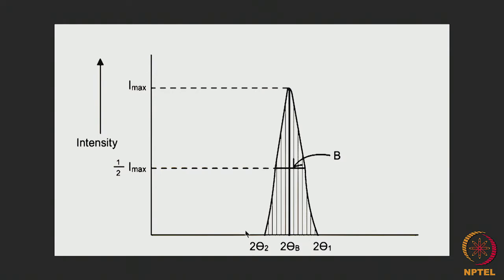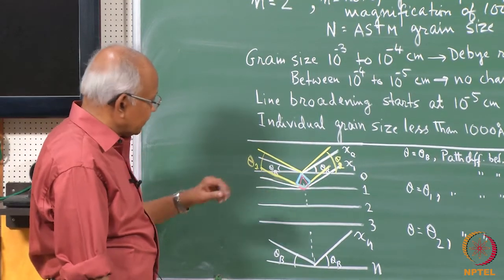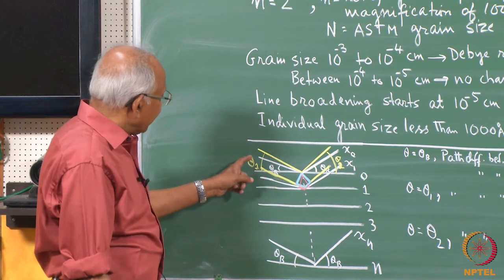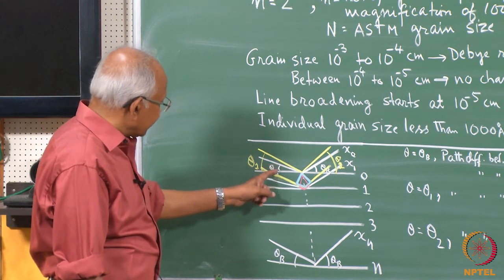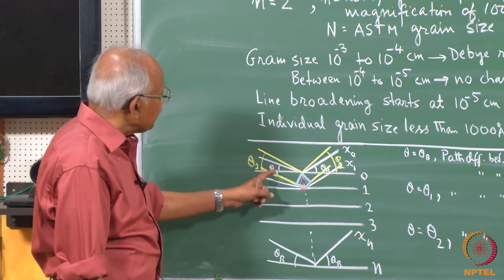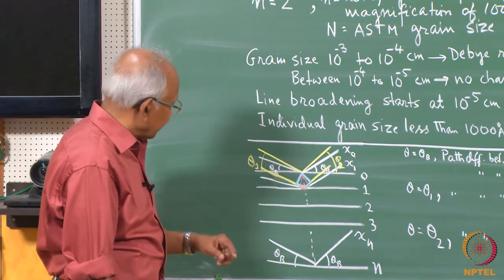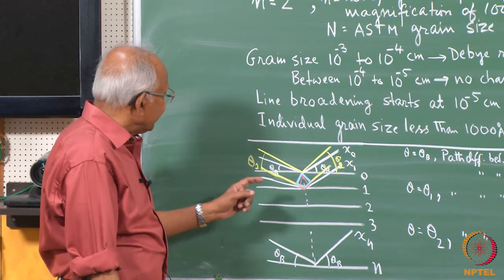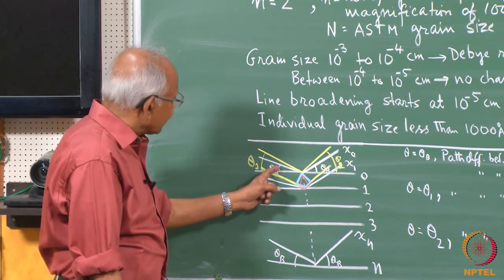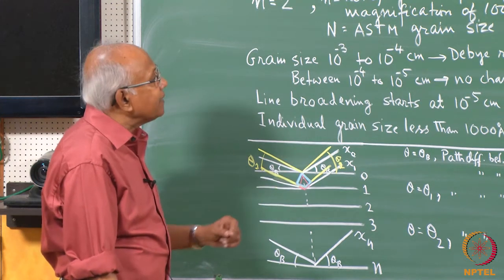You see, whenever we have diffraction occurring from a series of planes, say when the incident radiation is theta b, the Bragg angle necessary for diffraction, then there will be a diffracted intensity. But even when Bragg's law is not perfectly satisfied, that means the incident angle is slightly different from theta b, then also we find some intensity.